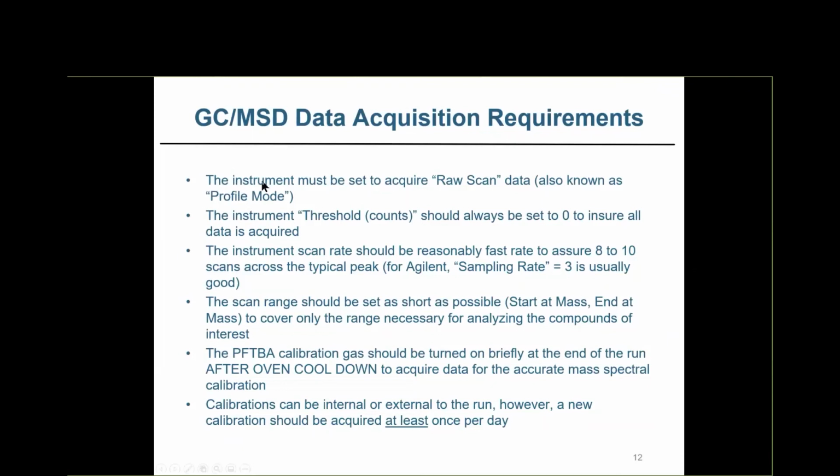The first one is obviously, and I'm going to show you how to set this, the instrument must be set to acquire raw scan data. Depending on who you talk to and what the vendor is, it's also known as profile mode data.